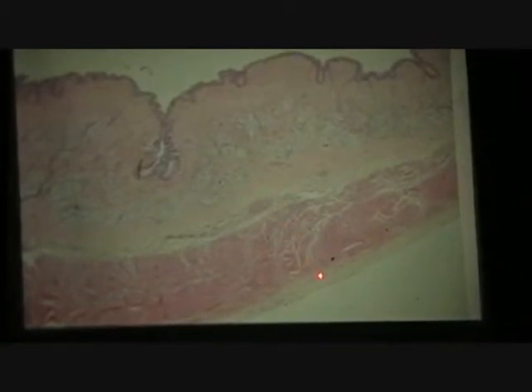Muscularis externa. May ask, well, what is the grain of this layer? Circular. And this layer? Longitudinal. Yep. Some would say lengthwise, which would be fine.